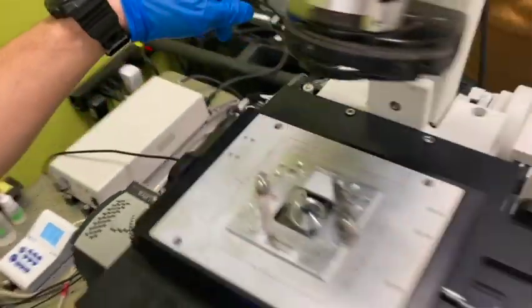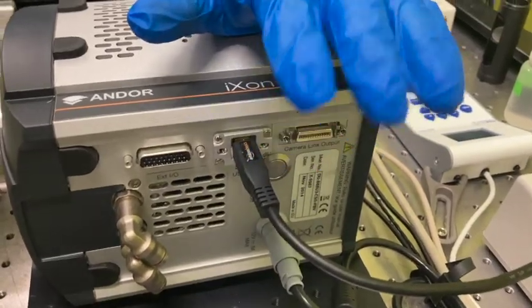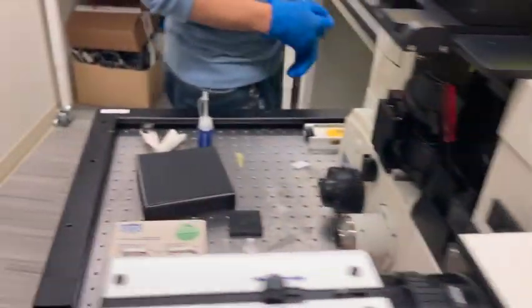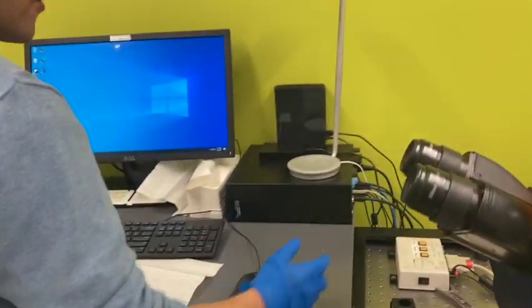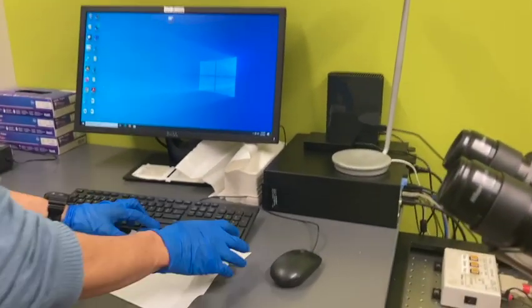Maybe you go out there and can feel it here. There is a button here. That's the switch. Push it, and that's what's going to happen. Dun, dun, dun, it's connected to the computer. And you might need to wait for a while, like 30 seconds or something, to turn on the software.